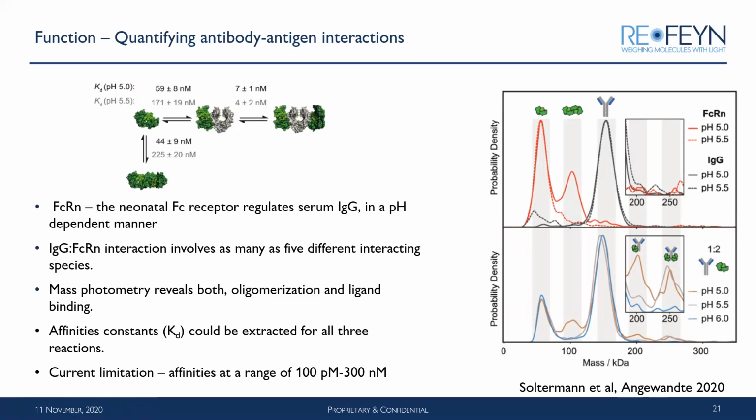You can also study exactly the KDs of the reaction, and study it in different buffers. As I said, mass photometry can work in different buffers.